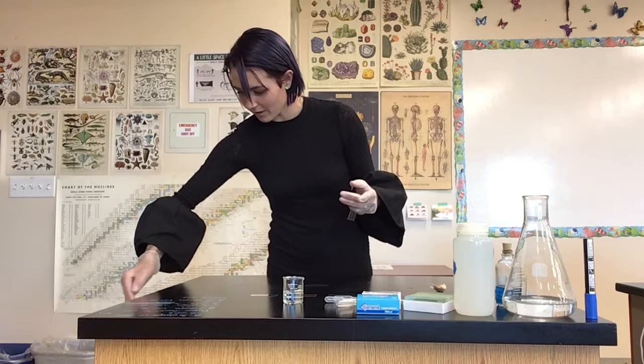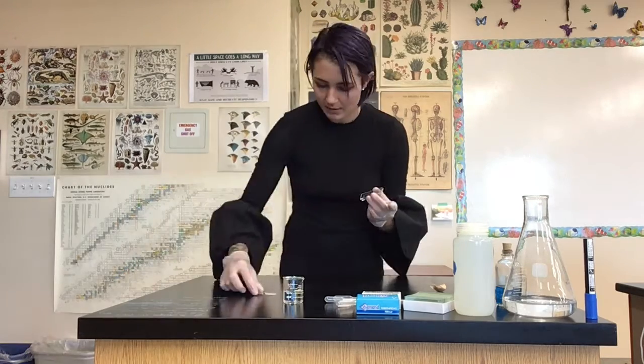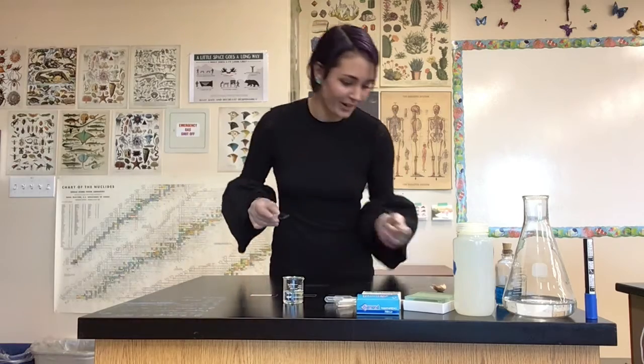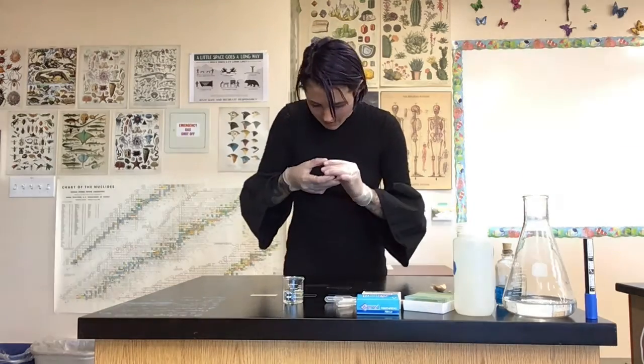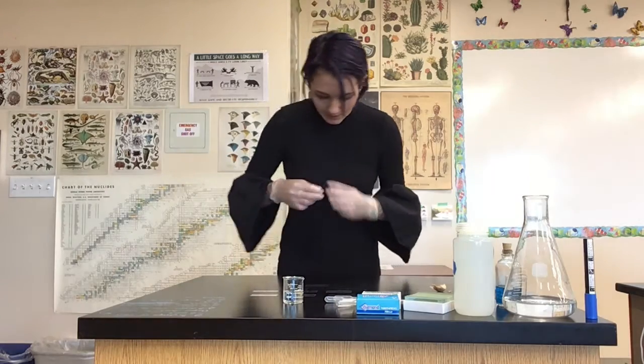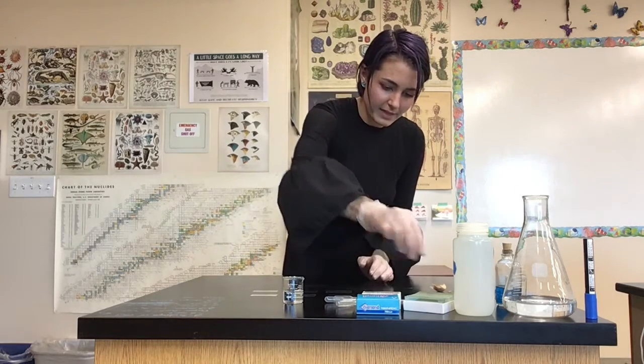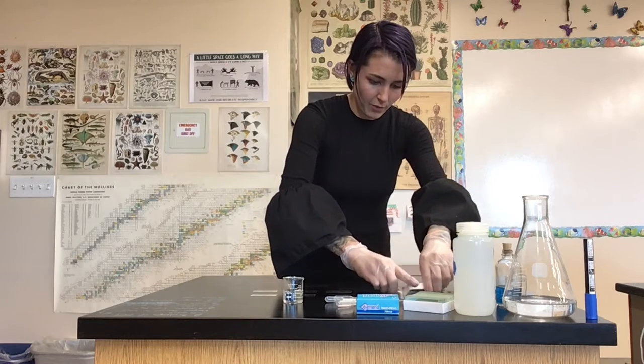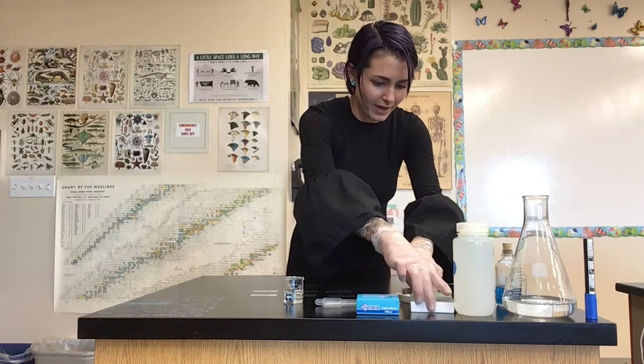I'm stronger than I look. Okay, I think we are good with the number of slides I have laid out. Just going to open the box for the slide covers to get that ready.